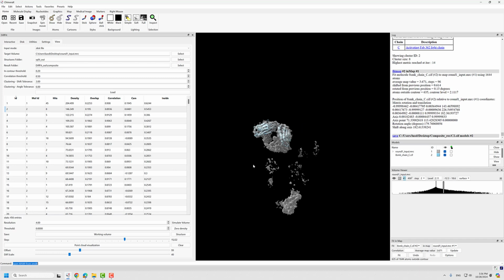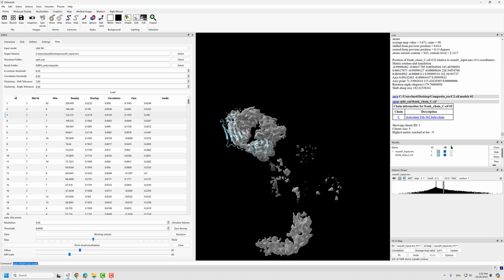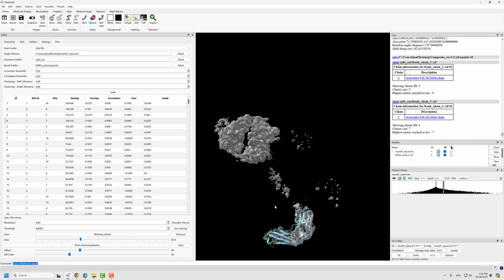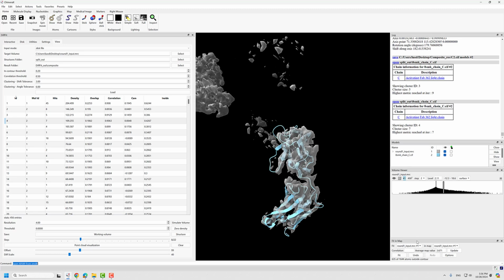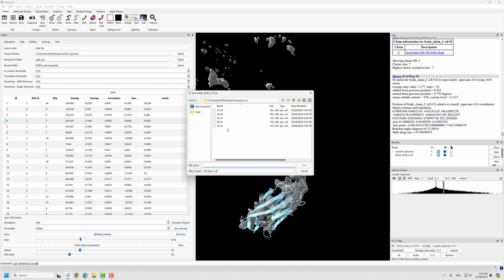Now there is another one that's here, that's 2. Of course, you can see this doesn't follow the density, so we reject that. Now here it follows the density nicely. Here you can tell. Let's refine it and save it. Save the structure.